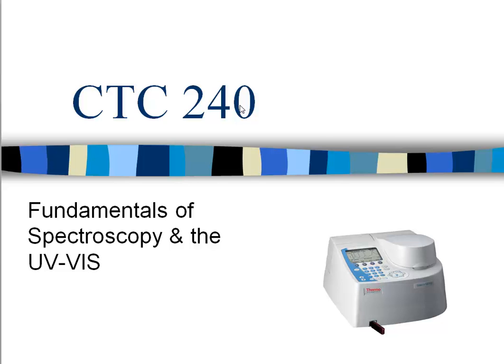What pieces and parts are required in order for me to do analysis with it in a laboratory? And the third portion will finally be the data analysis portion. So what can we do with the numbers that we get from the machine? And then how do we utilize the software that you will be using to run our instrument?